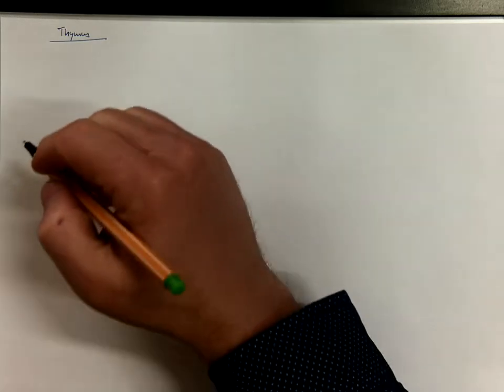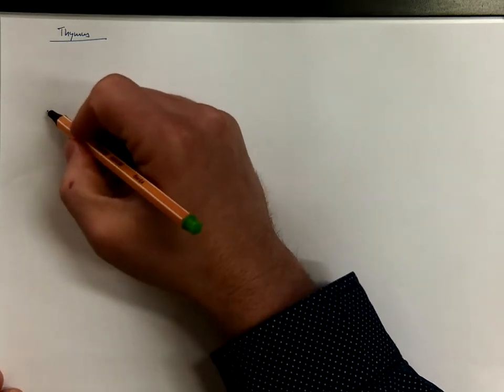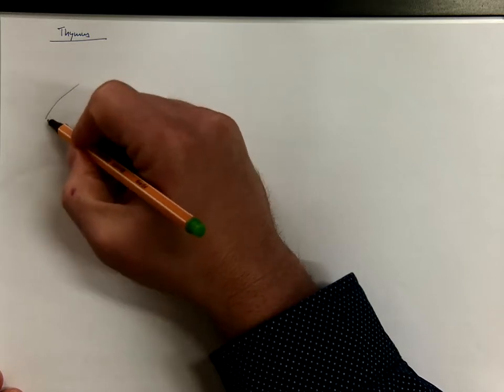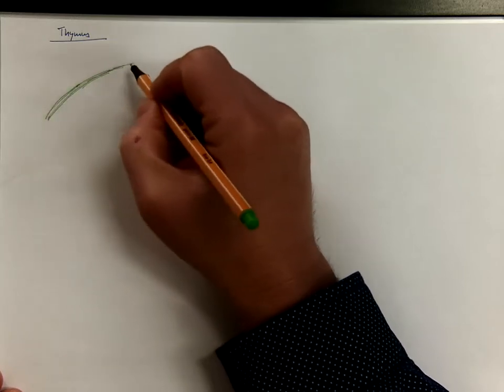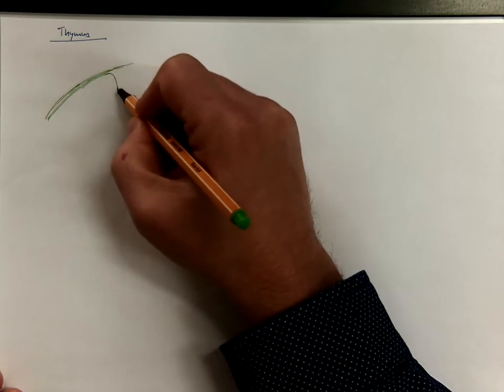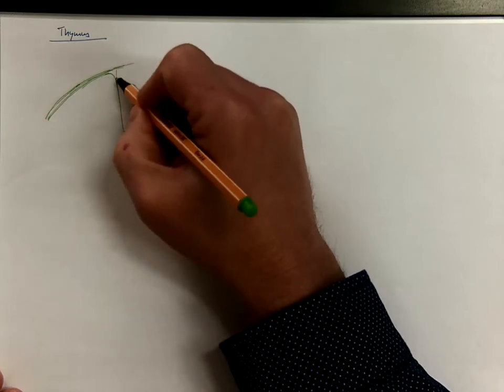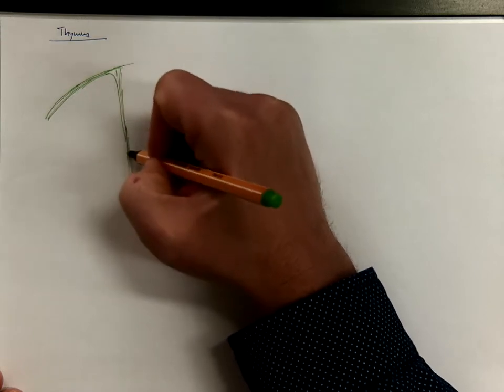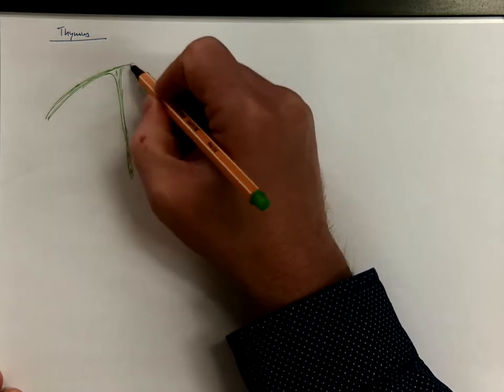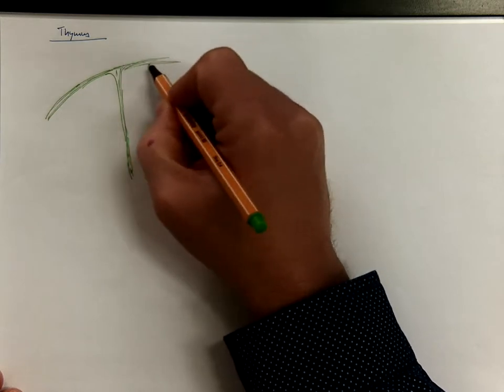Let's make a scheme of thymus that will hopefully help us to understand the real slides. The surface of thymus is covered by a fibrous capsule from which connective tissue septa radiate into the deeper tissue, subdividing it into pseudolobules.